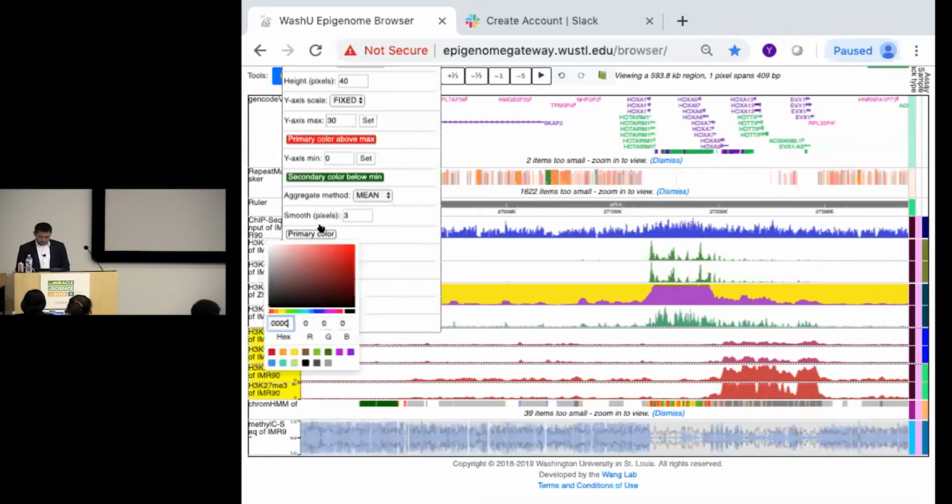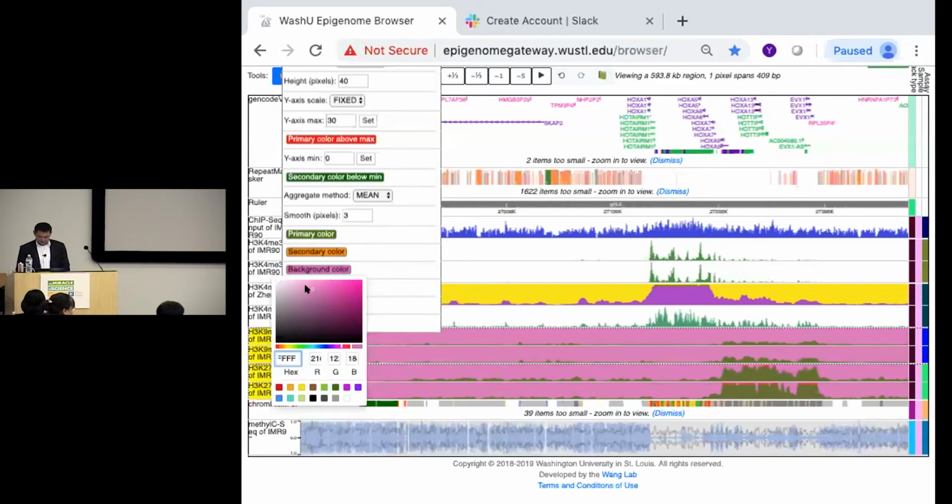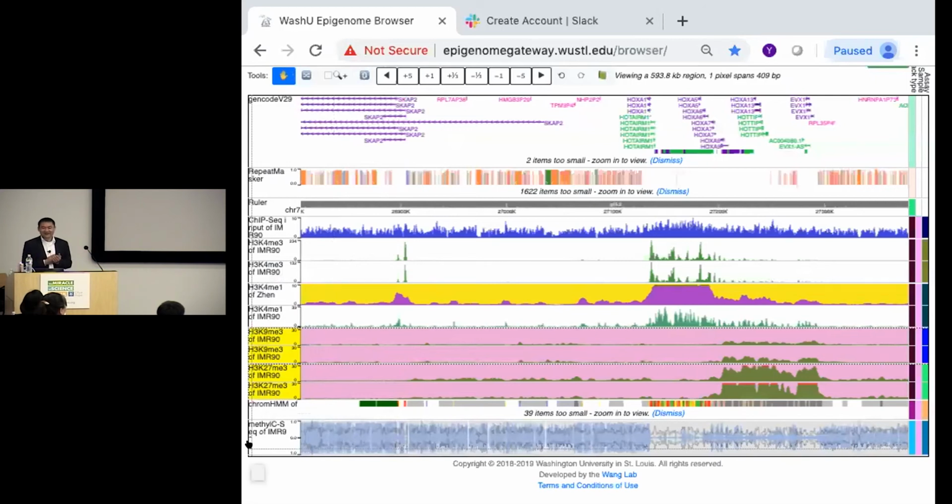I'm going to change my primary color to blue, this type of blue or this type of blue. There's all sorts of things you can do. You can design your own color. You'll change your background to, where's pink? My favorite color is pink. I have two daughters, so I have to like pink. That's a nice color. You can go crazy with this.